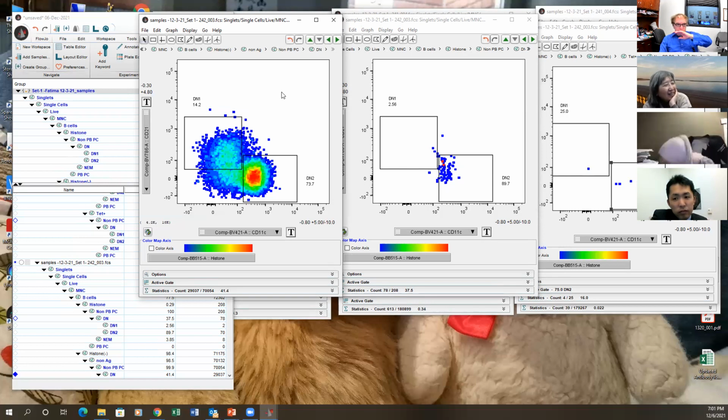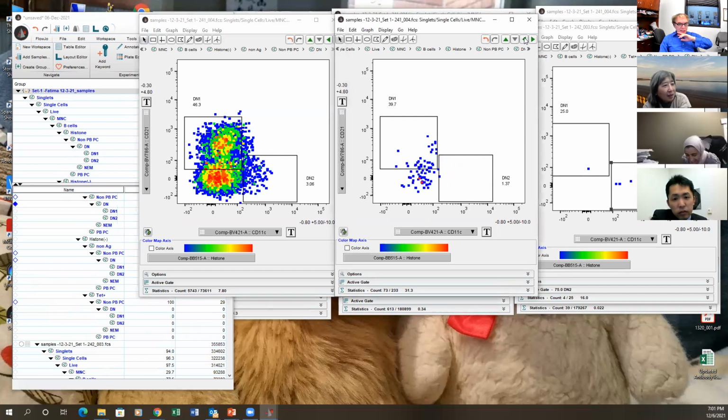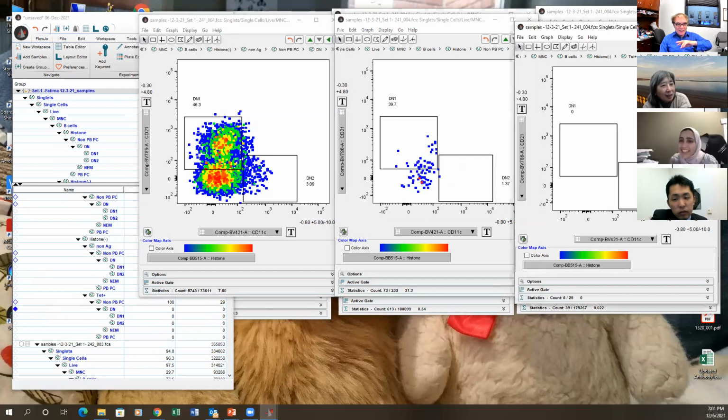Oh, let me check. Wei Chen, can you put 241 all the way across? 241. Yeah, you got lupus nephritis, you are right. That's right. 242, right. She got lupus nephritis. Right. Even though I did not give you the data. That means I did a good job. You did a good job. You did a wonderful job. Yeah, very good.